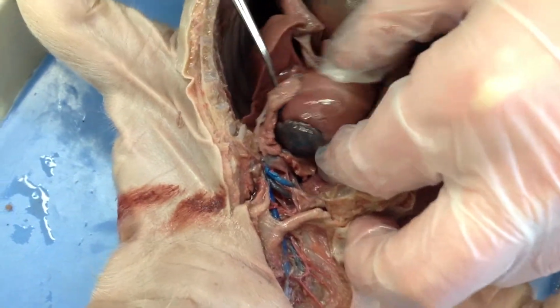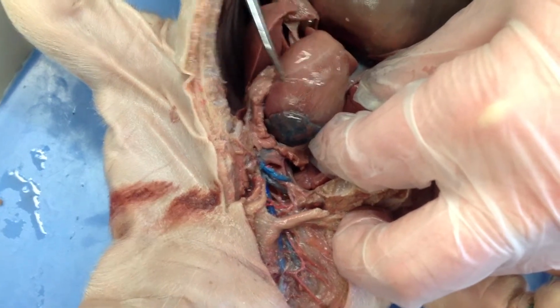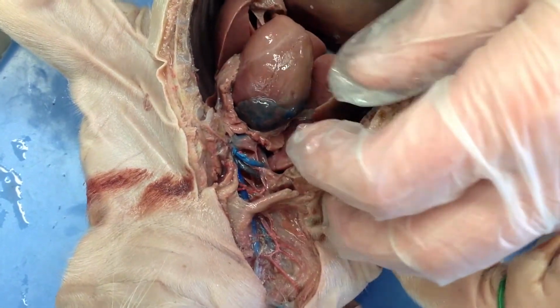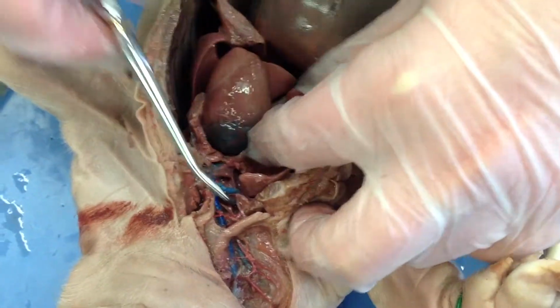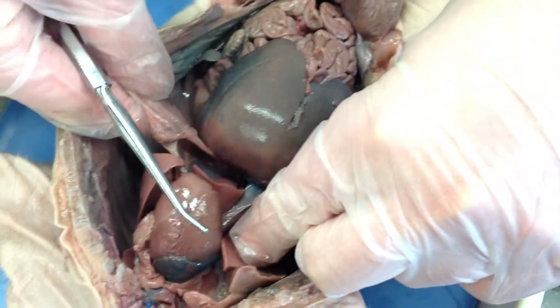Here you see the heart. It's the left side of the heart. Right here you see the coronary artery, coronary sulcus, and this is the right side of the heart. Okay, let's see what else we have here. All right, then we go into the abdominal cavity.